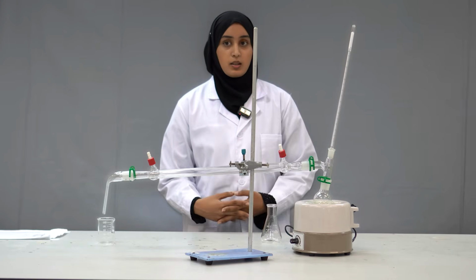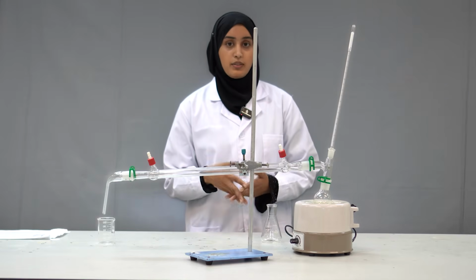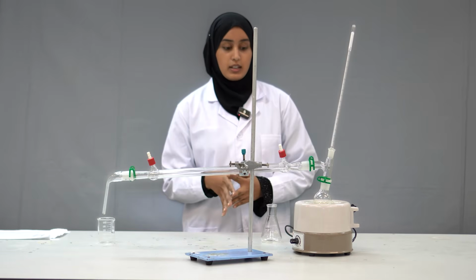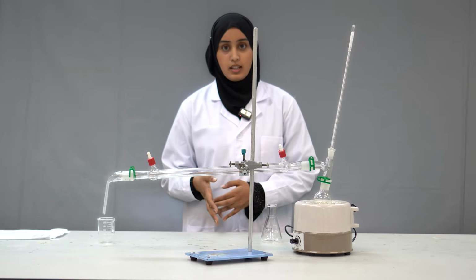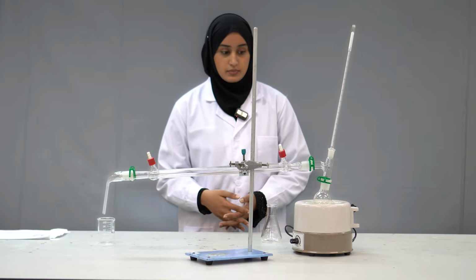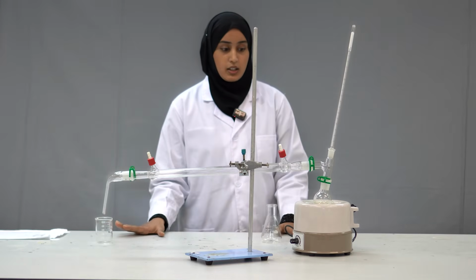Let's, for example, take a mixture. Now, when we heat up this mixture, the liquid with a lower boiling point will vaporize first, and then it will get cooled down and condensed back into a liquid, which will help us to separate all the different components in that mixture. So here we have a small distillation setup.